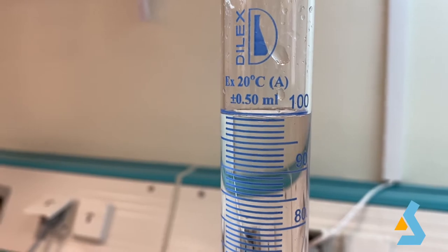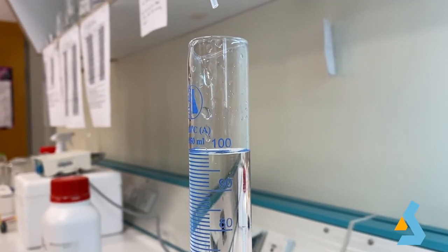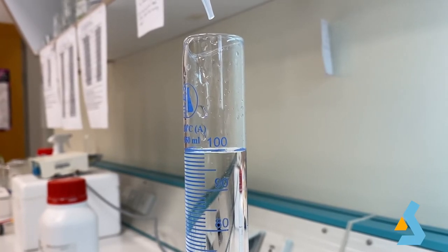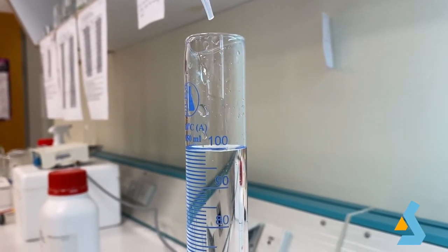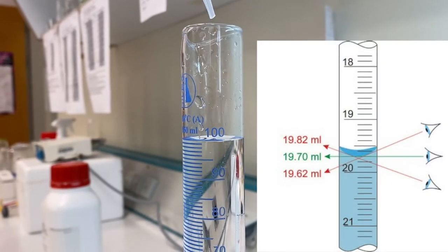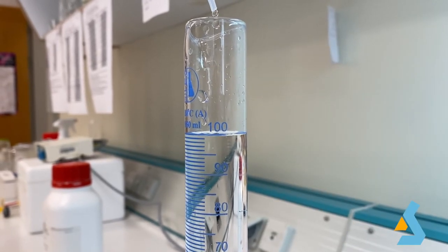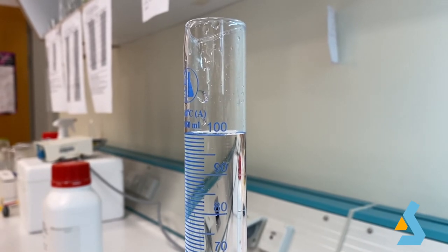The meniscus is formed when the sides of the cylinder pull the water up the sides. This is due to adhesion. Adhesion refers to the tendency of water molecules to be attracted to other substances. You should always read the bottom of the meniscus. Therefore, it is critical to check the level from eye level. Otherwise, the result is considered inaccurate. To make sure the meniscus is at the correct level, you can top up the solution in a drop-by-drop manner.